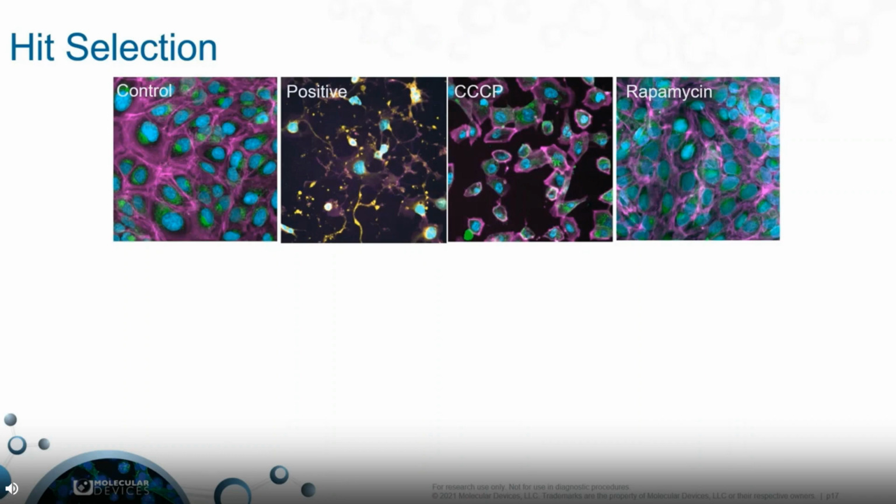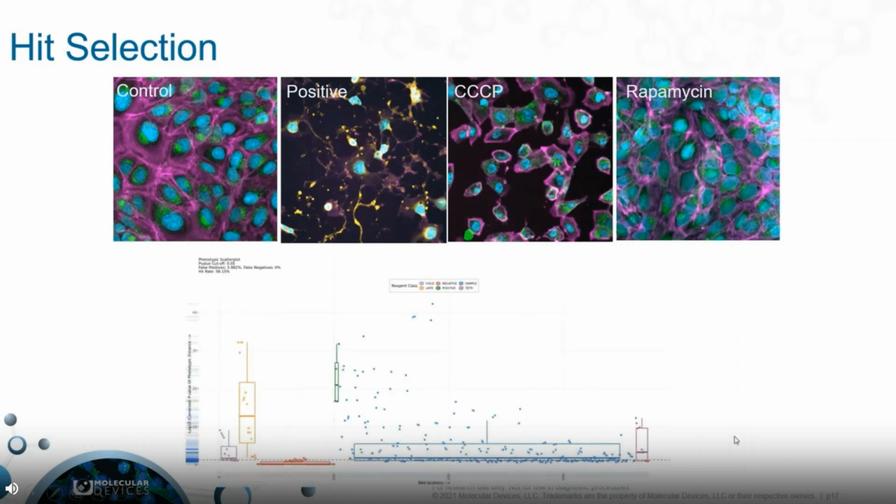Prior to hit selection, the data was reduced using principal component analysis. In hit picking, these calculated factor scores are used to identify significant outliers, and this is represented as a metric referred to as the distance score. The distance score represents the phenotypic effect of treated cells compared to control cells. Shown here is a scatter plot of the distance score for the plate. The color coding represents the control versus the treated groups: the red represents the control wells, and the color bars represent the treated group.